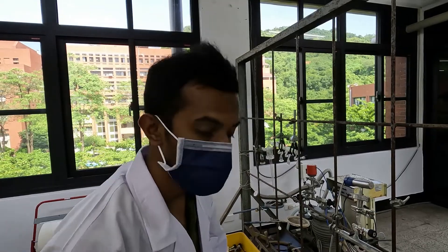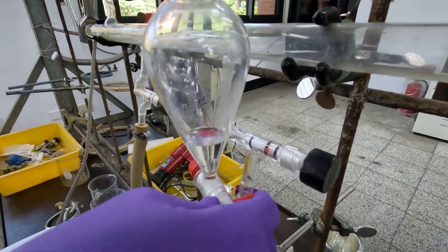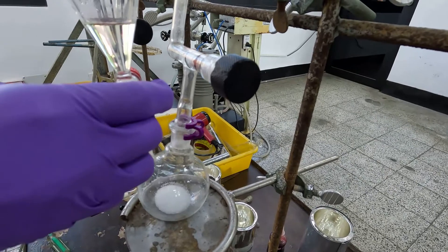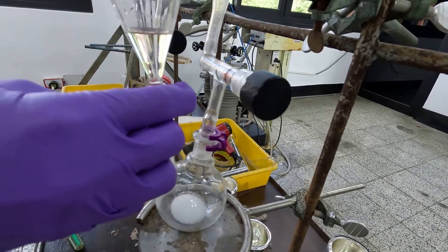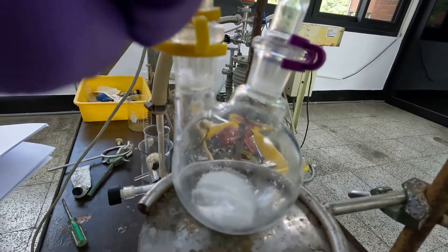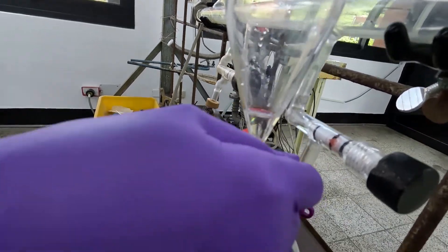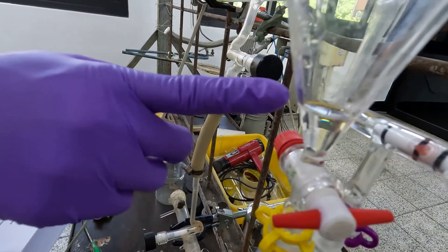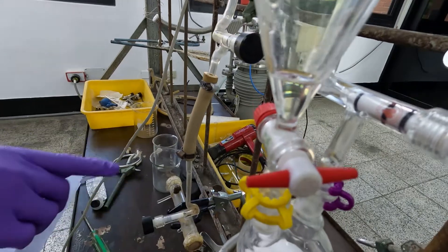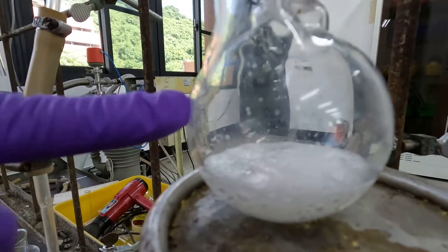Now I am going to do the HCl gas transfer. For that, you have to turn the valve of the dispensing funnel very slowly — do not open it too fast. You have to add the sulfuric acid to the sodium chloride very slowly. Do not add all of the sulfuric acid, because if you do, air from the dispensing funnel can enter the setup. Now you can see the sodium chloride and sulfuric acid are reacting and producing HCl gas.